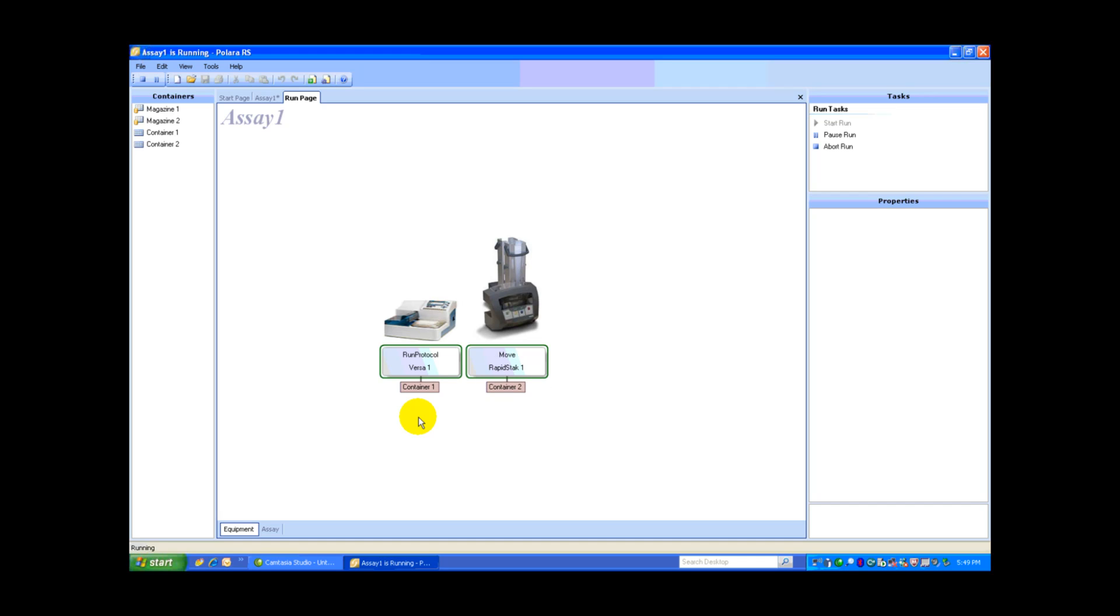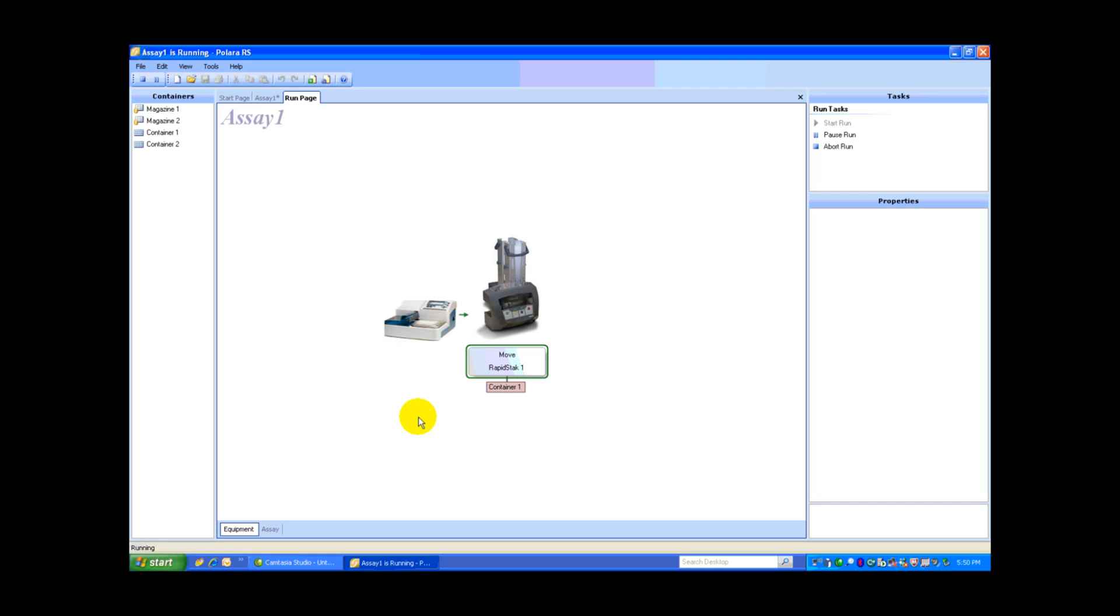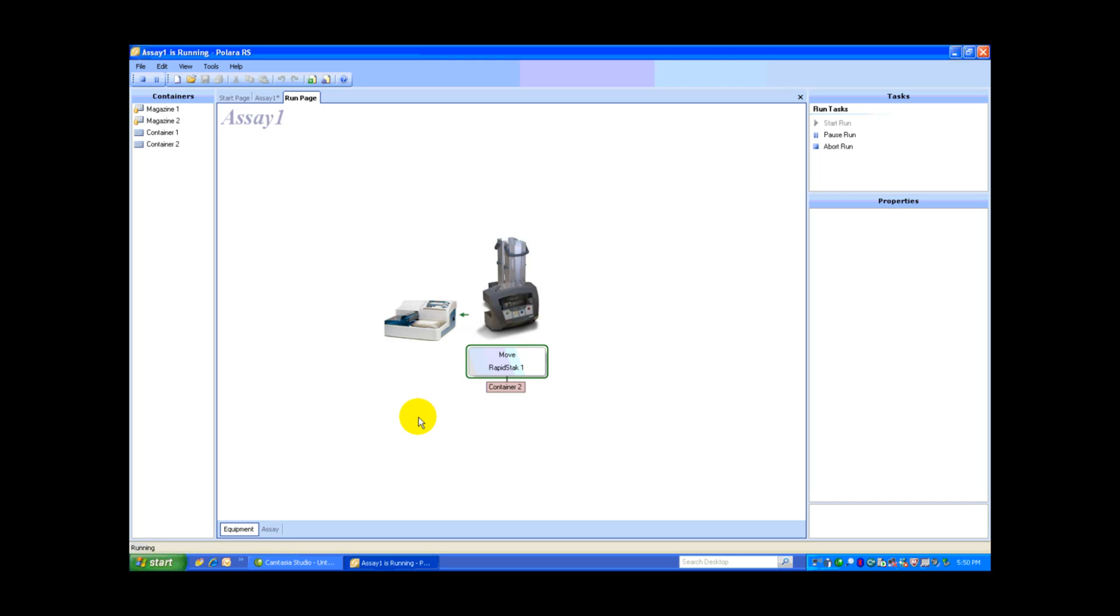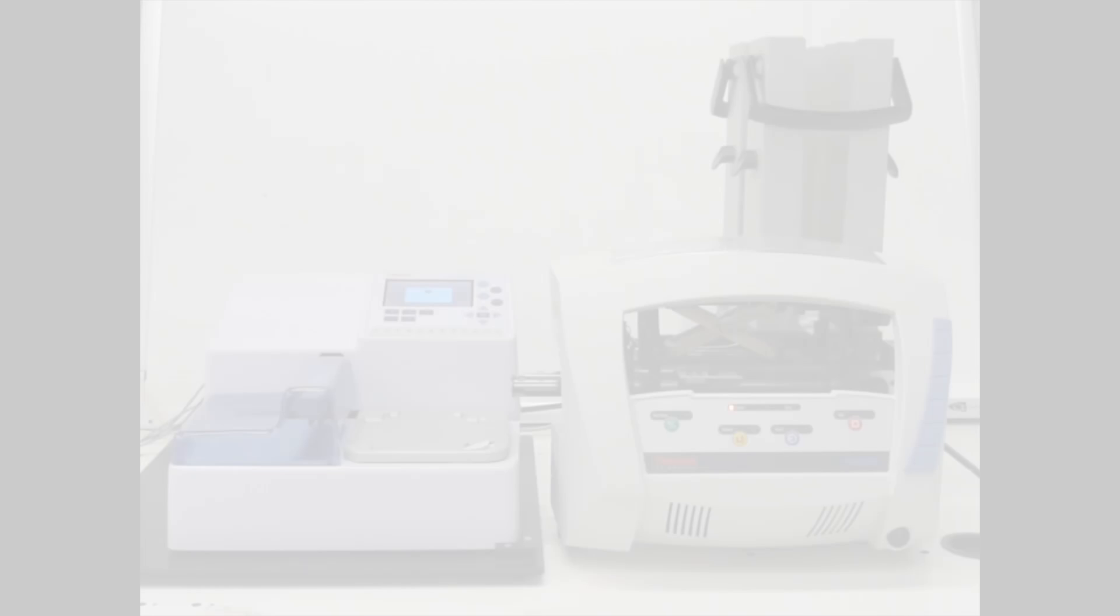The Versa is running Protocol 1 and the RapidStack is prepping container number 2. We'll just watch for a moment longer to see it retrieve a plate on the screen. And there we go. The RapidStack is moving container 1 back to the RapidStack and then it is reloading plate number 2 into the WellWash Versa. Let's see what this looks like on the actual equipment.